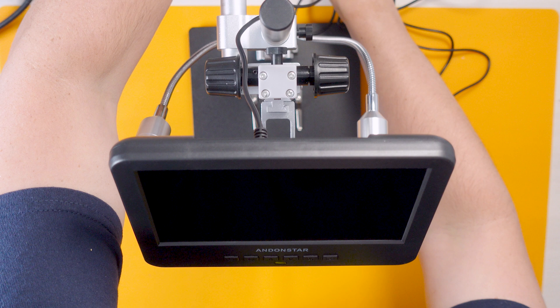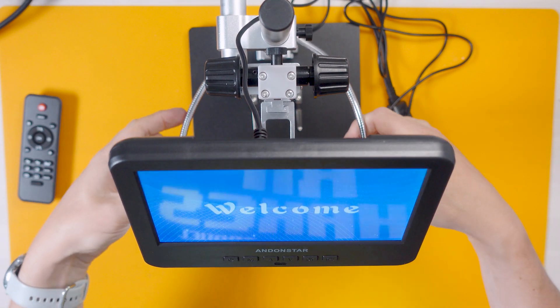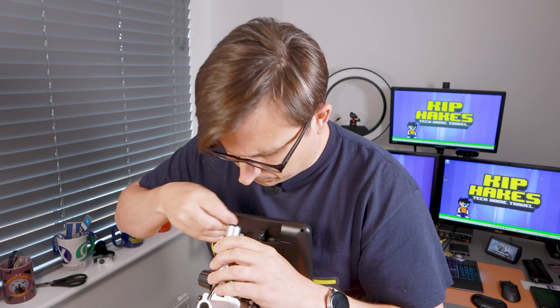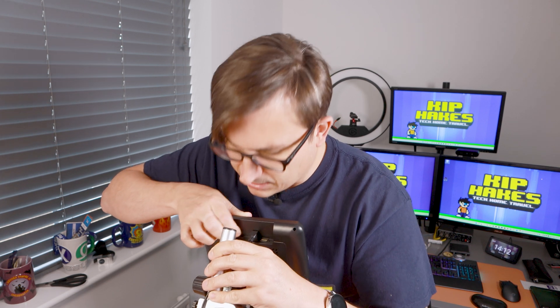There is a version of this that comes with a slightly bigger screen — I think it comes with a 10-inch screen — but I think seven inches is more than enough. Let's plug it into some power and see what happens. We have lights on! I think I'm going to insert an SD card. It does come supplied with an SD card but I'm always nervous about unbranded SD cards, so I've got a SanDisk SD card to go in. Hopefully we shouldn't lose any recordings.